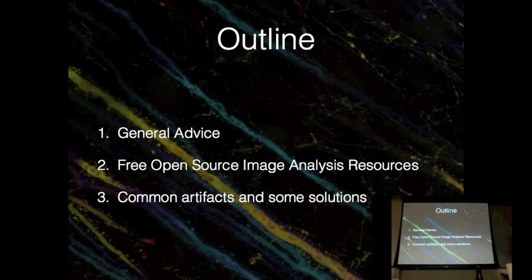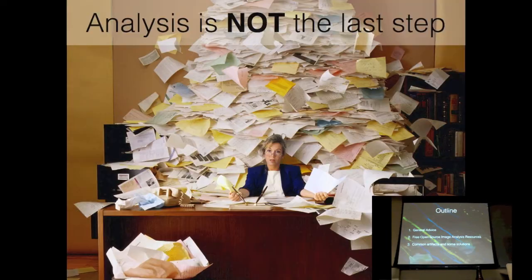So the outline of the talk is, first I'm just going to talk about some very general principles about image analysis, which I think speak to programmers and non-programmers alike. Then I'm going to talk, as Alex said, about various open source packages that exist to help you with your image analysis. And then finally, I'm going to talk about some common artifacts that come up in the course of imaging and some things that you can do to try to deal with them in the analysis step.